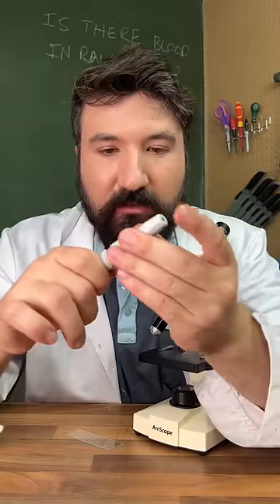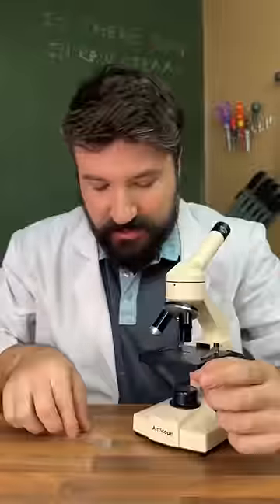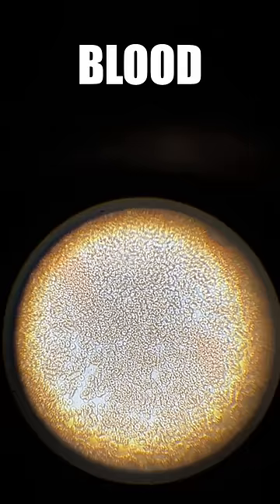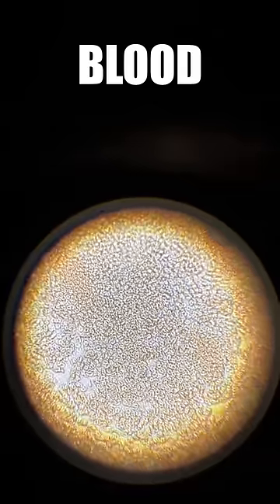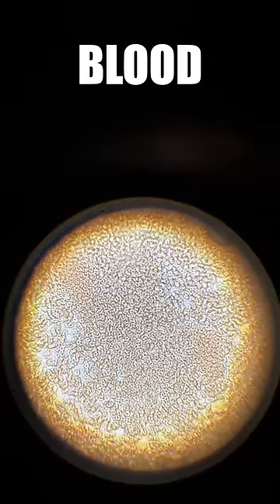The first thing we need to do is draw a little sample of our blood to put under the microscope. So we've got a little bit of our blood there. Let's put it onto our slide. Focusing on the blood from our finger, what we can see amazingly is all the red blood cells swimming around in the plasma. You'll also find platelets and white blood cells mixed in, but the main things we can see are the red blood cells — nice big donut shapes.